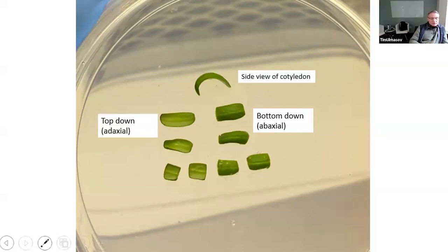So obviously today you're not using protoplast, but some people I talk to, they love protoplast. They transform everything through protoplast, and I'm wondering what's your opinion on pros and cons of doing that? Yeah, the pros and cons to me are the skill level to be able to do protoplasts. It takes some time to do that, having to be set up. It's one thing to be able to isolate protoplast.